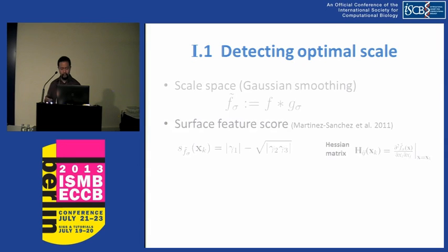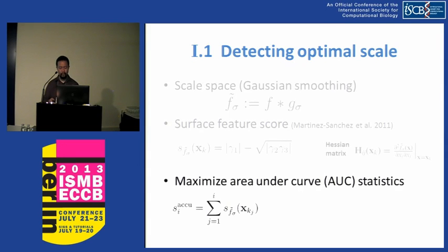Then, using such a surface score, we can calculate the cumulative score and calculate the area under the curve from such score.